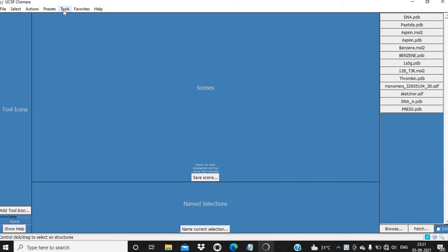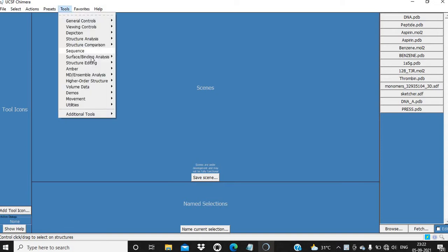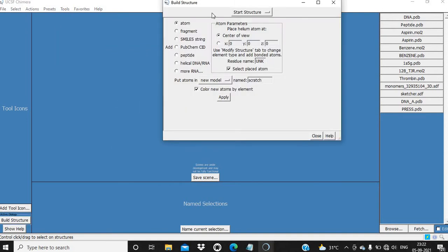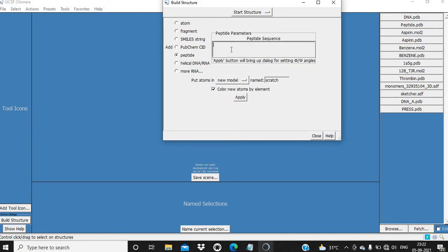In order to build peptide and nucleic acid, we need to click on the Tools menu, then Structure Editing, Build Structure. A dialog will appear. First, we are going to build a short peptide.